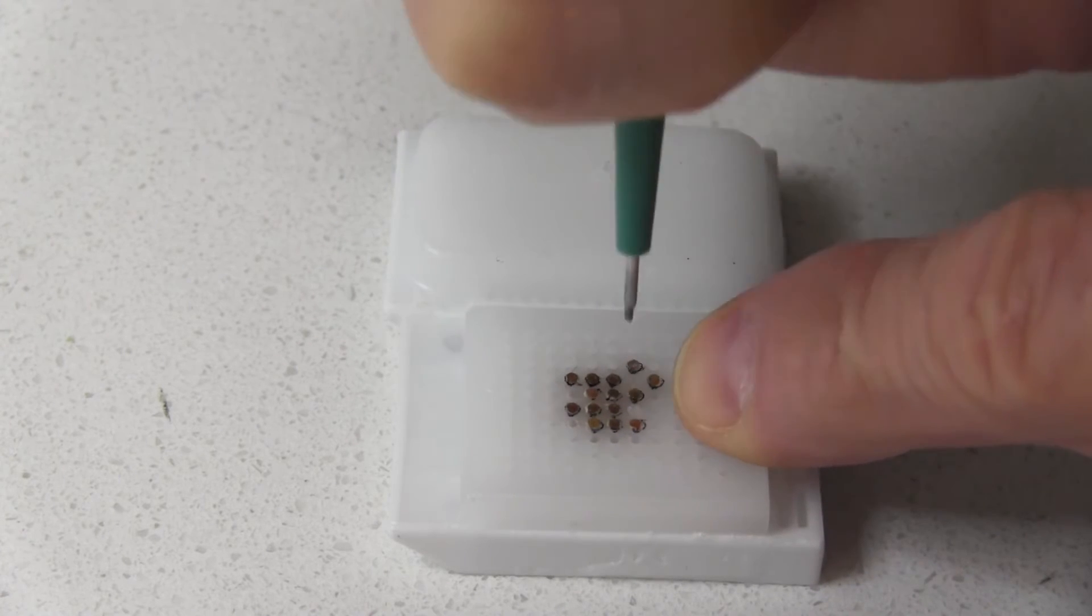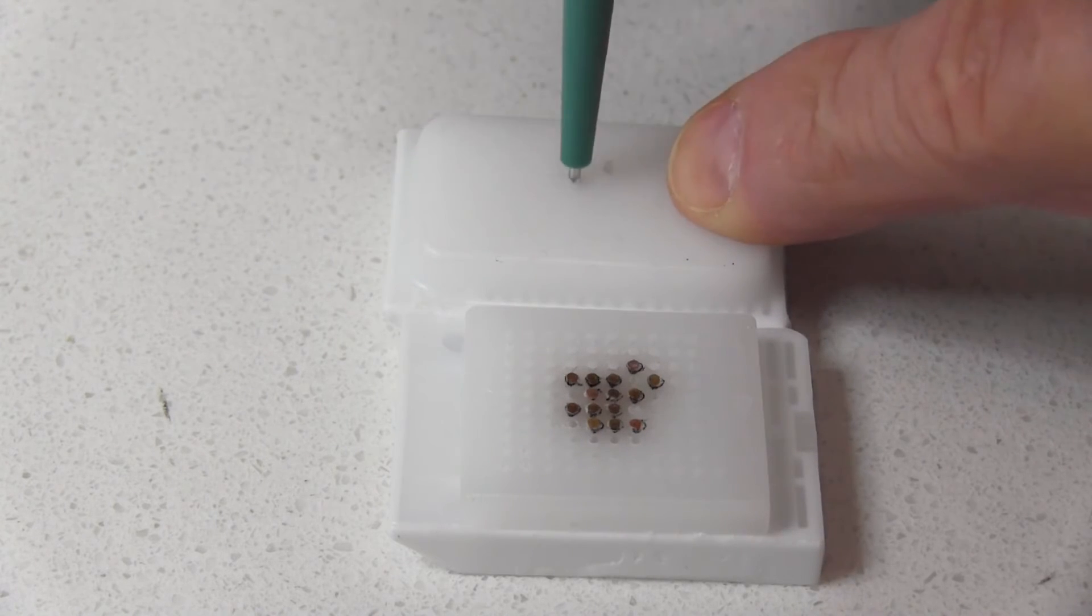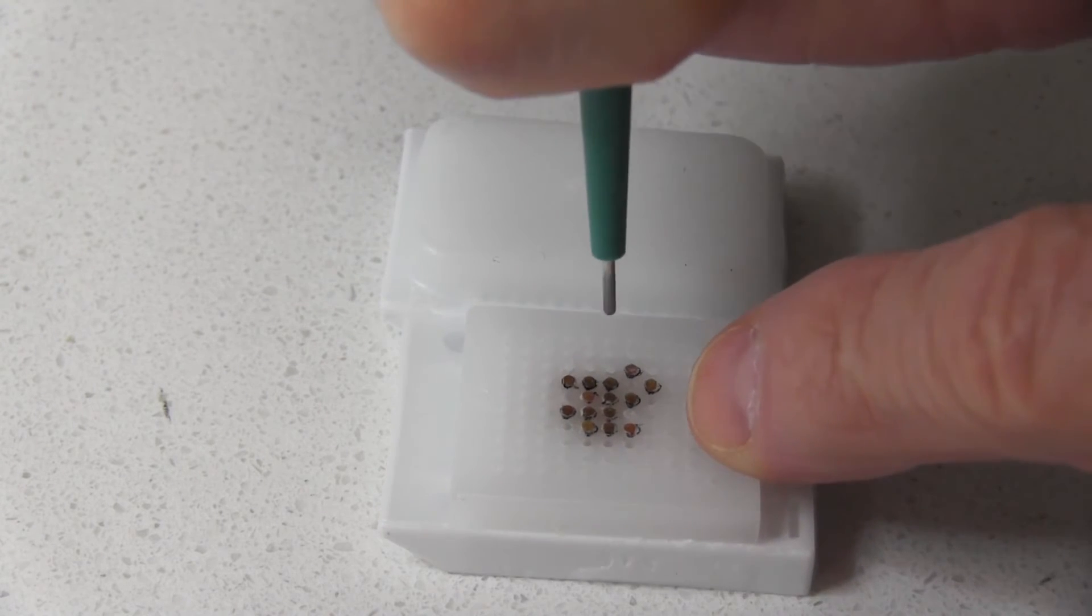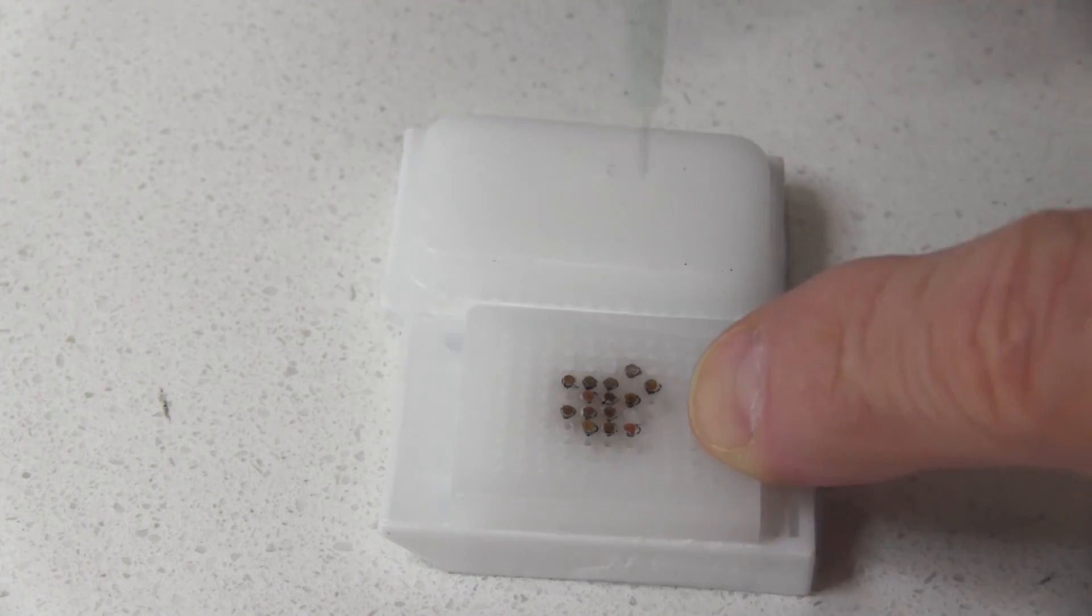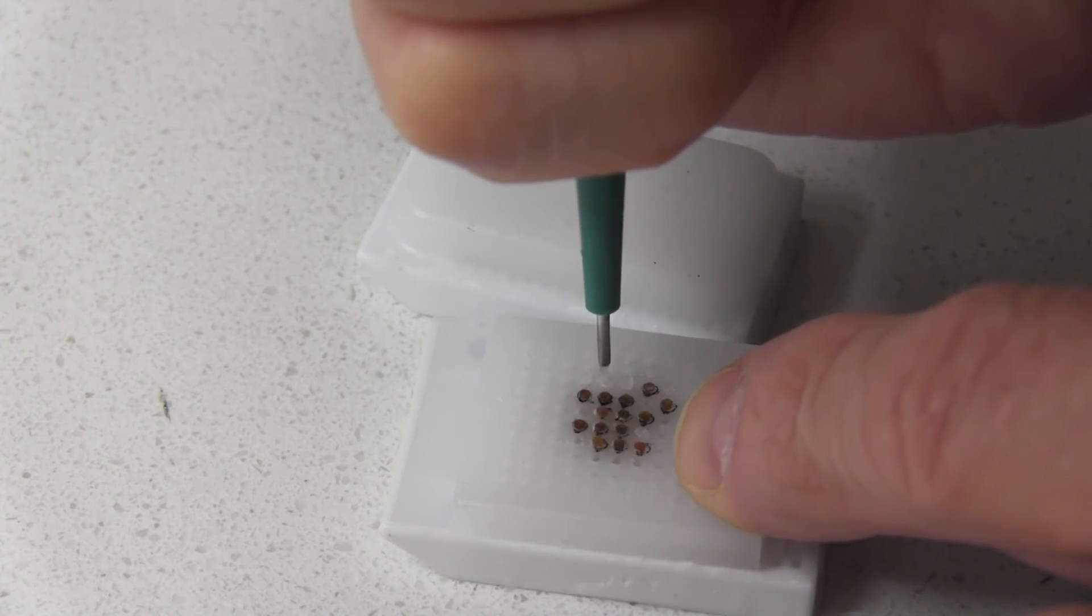Filling the blank spots with paraffin may feel tedious but it's very important for the structural integrity of your TMA block. This is easy to do and it's good practice for getting your punch techniques down.